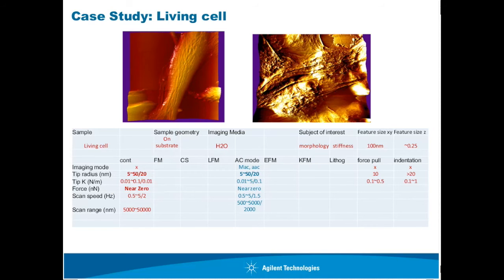AC mode, you can use MAC mode or AAC. Again, a sharp tip is pointless. And you need to use a very soft tip. And force is near zero. Scan speed needs to be lower, and so on and so forth.